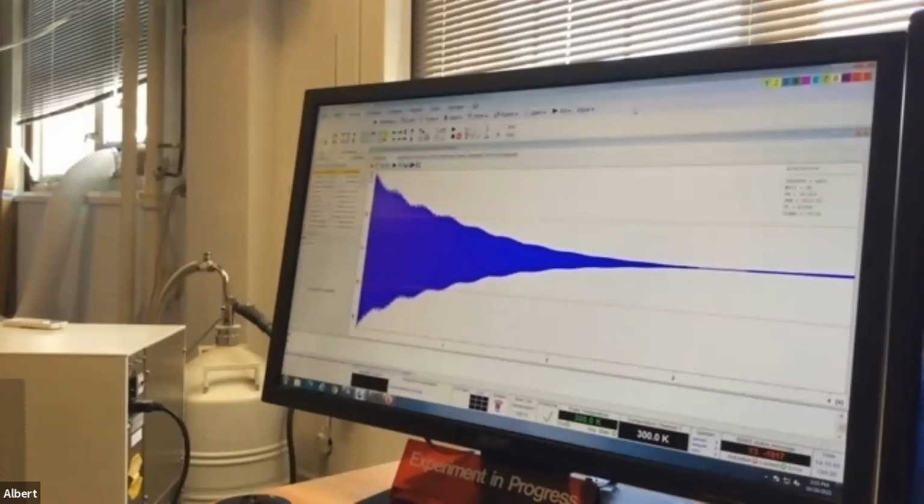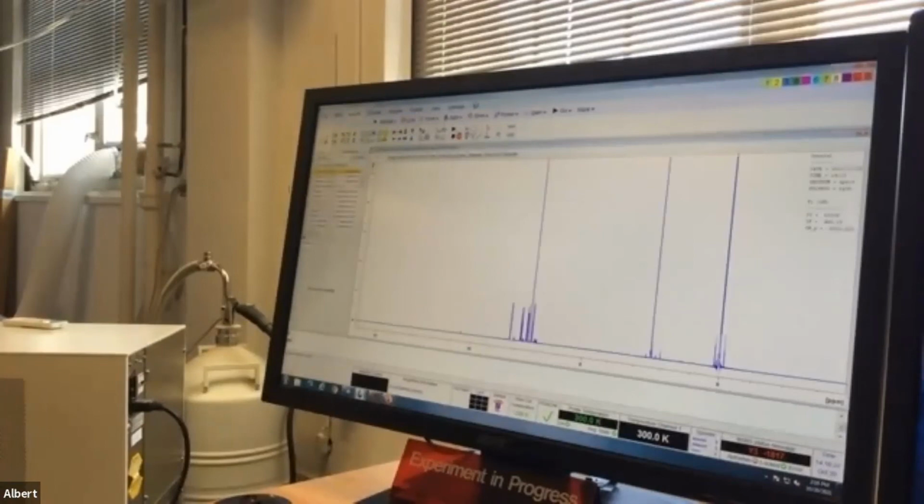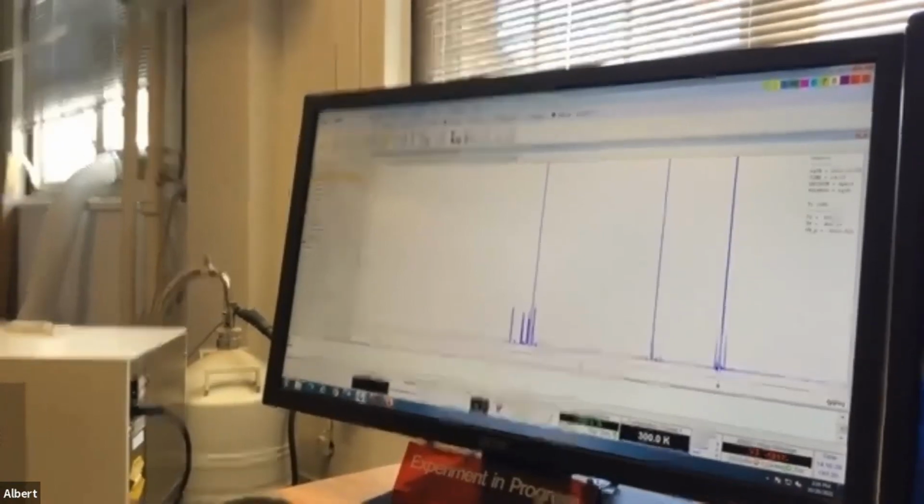Yeah. So this is the crude sample, and it's done. So you want to type in the transform, and then type in FT. And then again, it's out of phase, so you need to type in APK. And you want to drag it down, so that double-headed vertical arrow. Yep, drag that down. Okay, great. Now just hit the multiplier. Just hit it by 8. Again. All right, perfect.